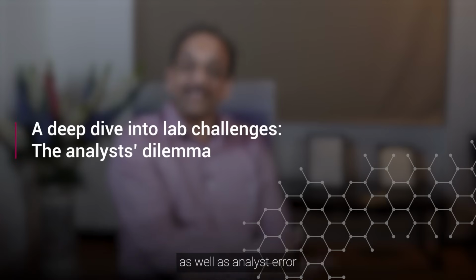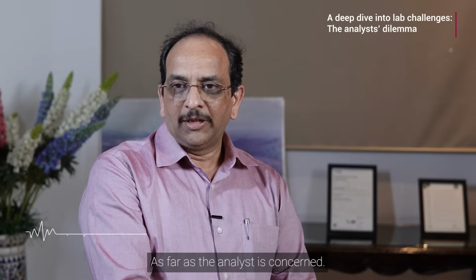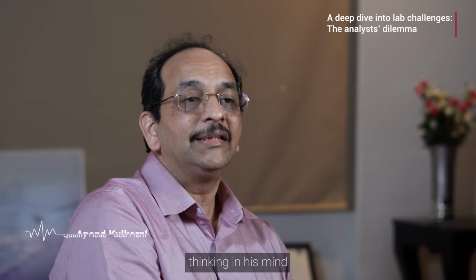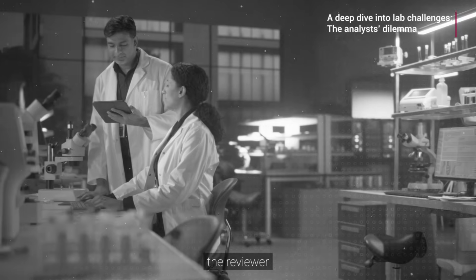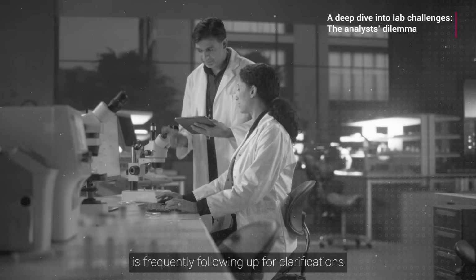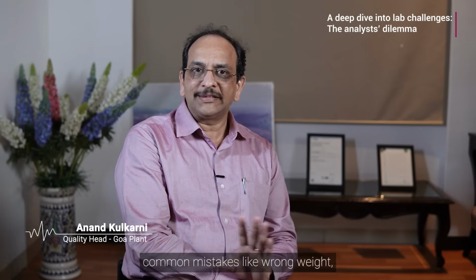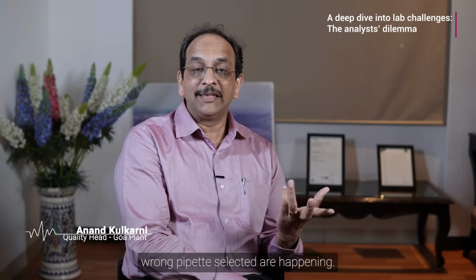Human error, analytical instrument error as well as analyst error are playing the major role in the incidents or OOSs. As far as the analyst is concerned, when he comes into the laboratory, he immediately starts thinking that he has to complete these activities in the 8 hours. And apart from this, the reviewer is frequently following up for clarifications and other details. In that, common mistakes happen like wrong weight, wrong flask selected, wrong pipette selected.